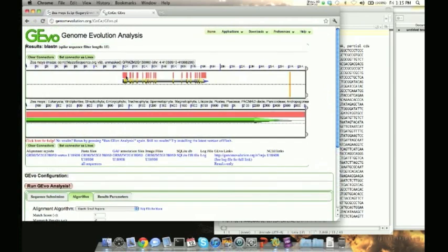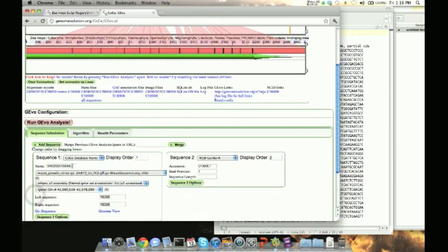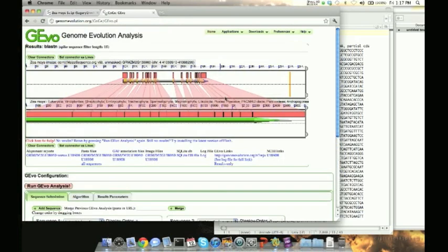Now, as you can see, I'm going to hold down Shift and click so you can see all the exons at once. There is a very good correspondence of each part of the cDNA to each individual exon of the annotated gene. So in this case, we can have high confidence that this gene annotated by maizesequence.org is in fact a good representation of the sugary1 gene that was cloned back in 1995. Obviously, you and I have seen this, so we're convinced of it.